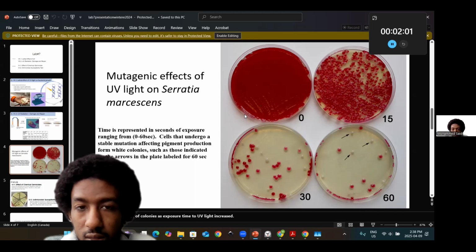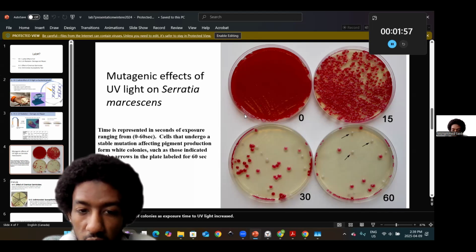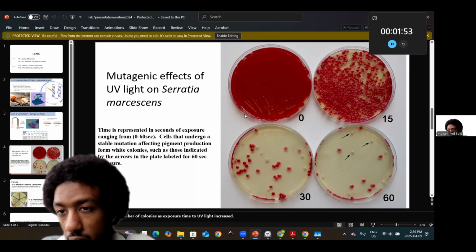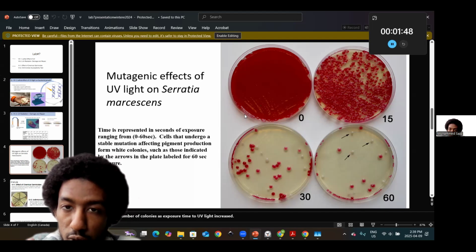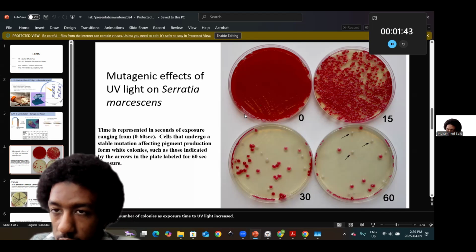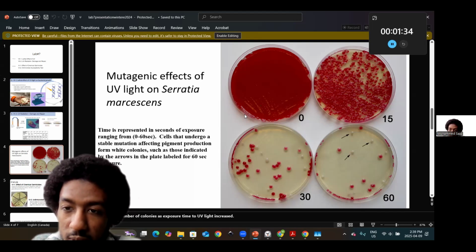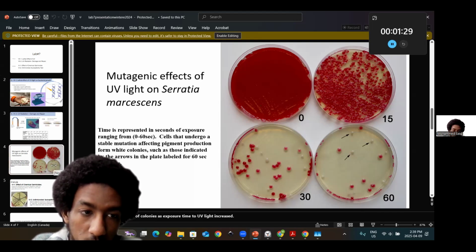Serratia marcescens. So you want to bear in mind that the colonial growth of resistant bacteria does exist, and thus could depict that even despite the pyrimidine dimerization, they were able to repair, with photolyase-like repair. The reason I bring this up is that you can appreciate that perhaps these bacteria will be able to grow post UV exposure.